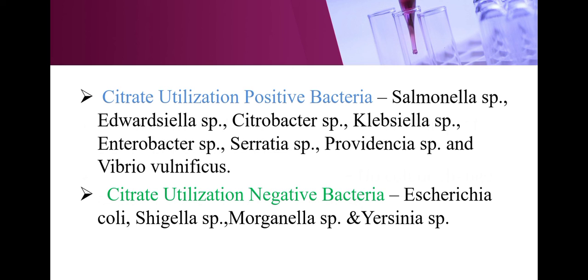Citrate utilization positive bacteria: Salmonella species, Edwardsiella species, Citrobacter species, Klebsiella species, Enterobacter species, Serratia species, Providencia species, and Vibrio vulnificus. Citrate utilization negative bacteria: Escherichia coli, Shigella species, Morganella species, Yersinia species. These all come under the citrate utilization negative bacteria.